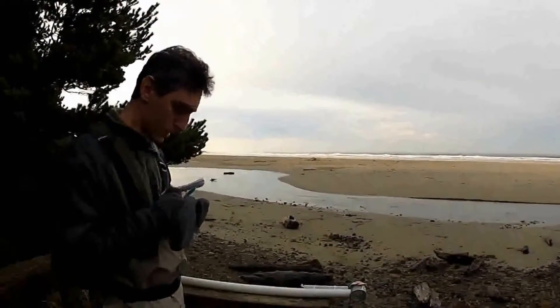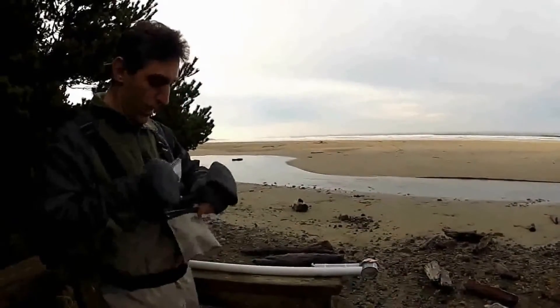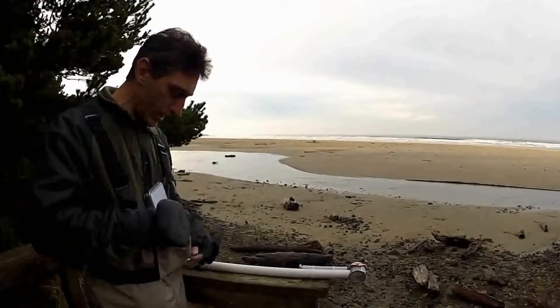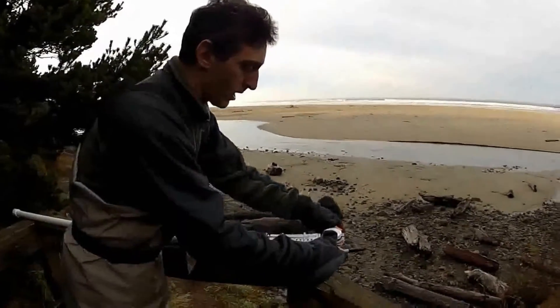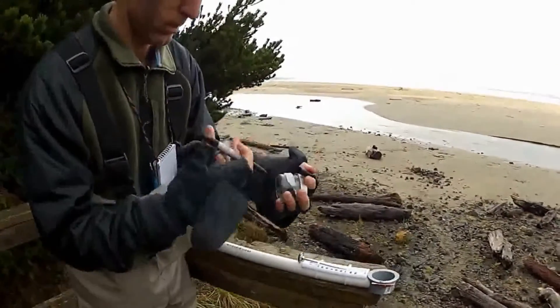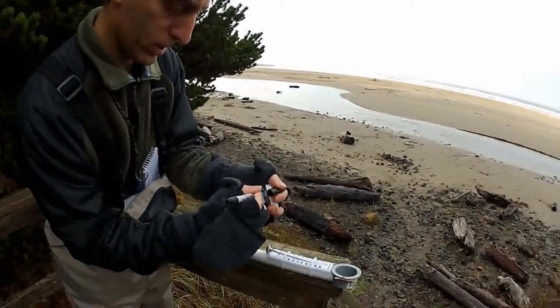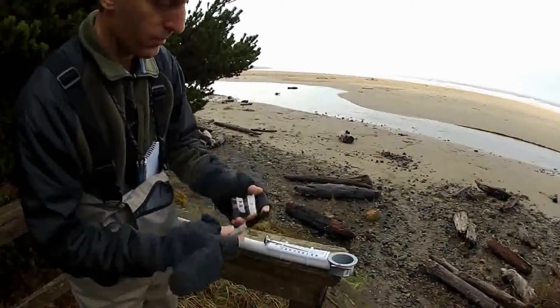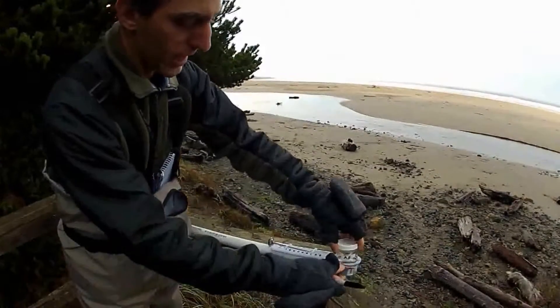I'm going to write the air temp down as 48. Now's also a good time to prep your sample container — if you haven't written on your jar or bag yet, you definitely want to do that before you get it wet. It makes it a lot easier and makes the label stick better. So I'm going to write on my jar 'Agate Beach, AB,' which is the designation of this site. I'll just loosen the lid a little bit; I don't actually take it off until I get all the way down there.